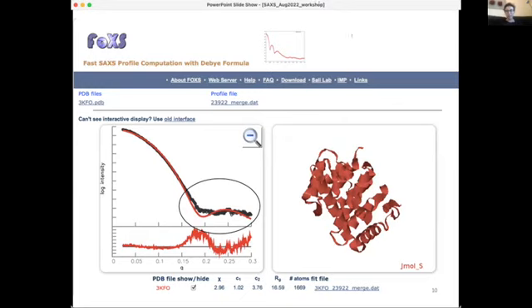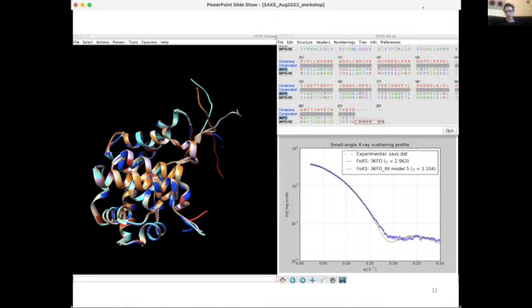But there are many other options. So I like using Modeller for this purpose. So whatever you like. So this is Modeller in Chimera, Chimera before ChimeraX. So you can see that it uses Modeller, and here you can see 5 different models with histags going in all the directions. Here you can see this histag that was missing, and you can see that the fit improves a lot. Okay, and we can do the same on the web server.